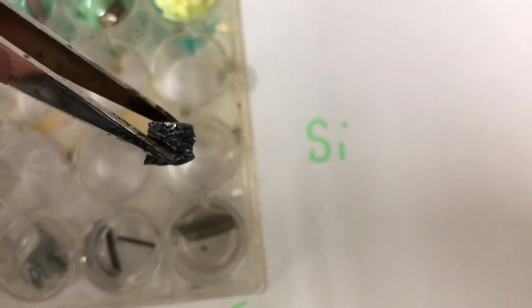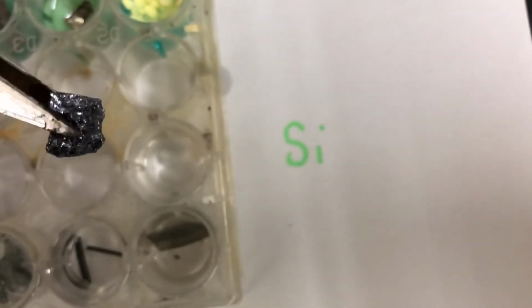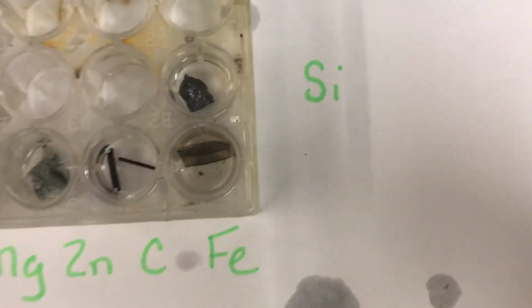Let's see, silicon, it's hard to tell if any reaction has occurred. It almost looks like it's not as shiny and sparkly, but in the end, I think there is no reaction. I think that was just the liquid coating it. So for silicon, I'd say no reaction with the acid.